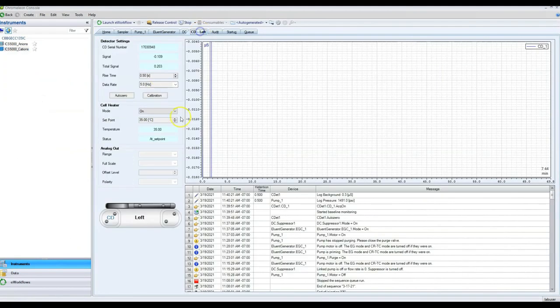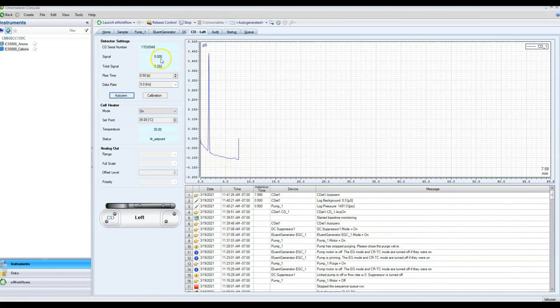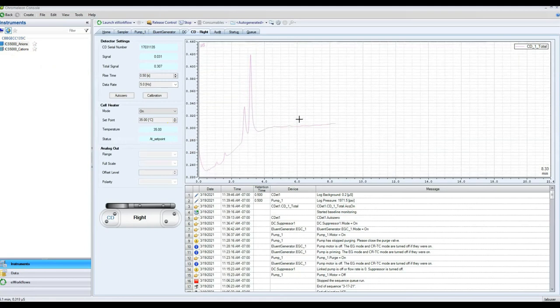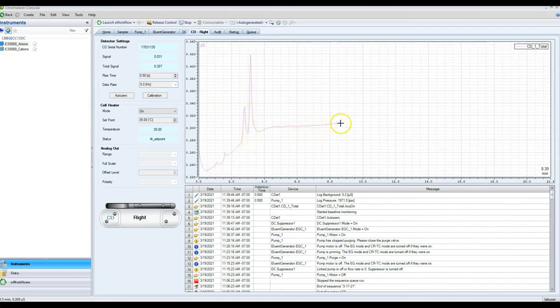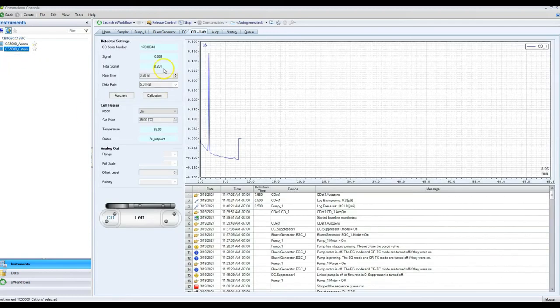Let's go back to our instrument and check on the baseline. It looks like something came off the column — you can see it's starting to flatten out but still changing a little. The anion side looks like it's flattening out pretty well too — not changing too much. We'll give it a little more time to make sure it's good. It looks like they're both ready to run, so you can just come in here and hit Start.